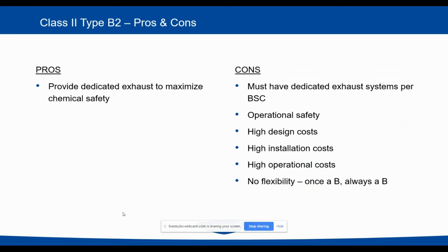So if you ever wanted to use the biosafety cabinet without venting and using precious, expensive energy, you simply cannot because the B2 will not start up and it will just be a dead air box that won't provide any personal protection.